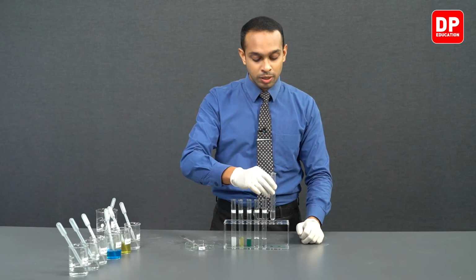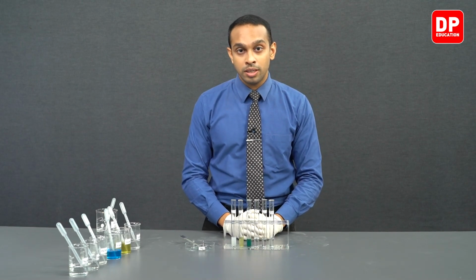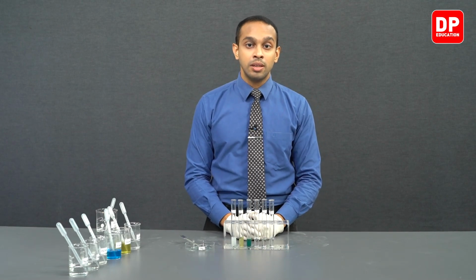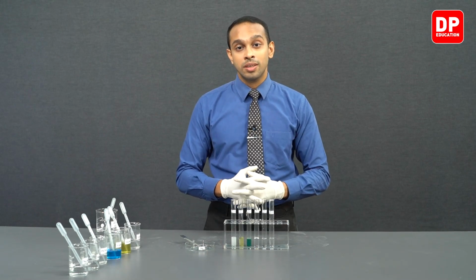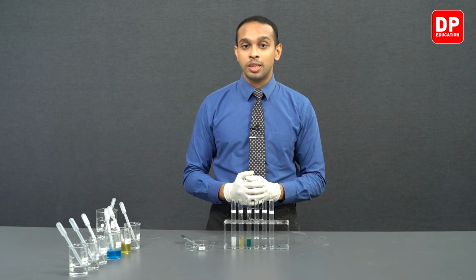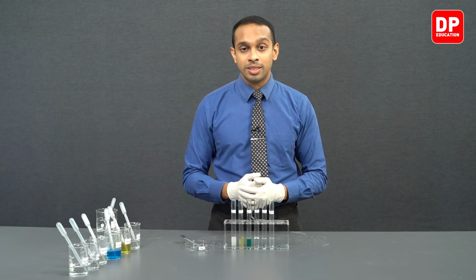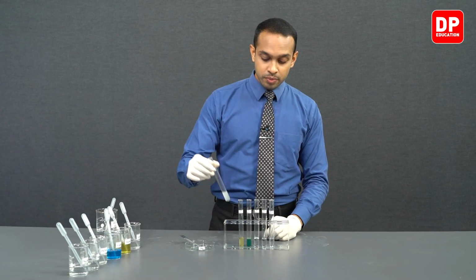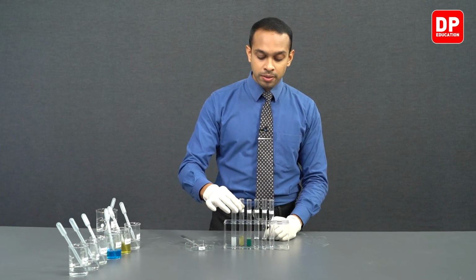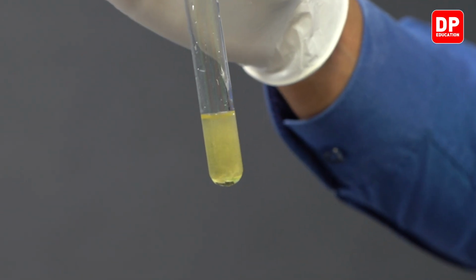As you know, magnesium is present in the second group of the periodic table. It's an alkaline earth metal, and this group shows very slow reaction with cold water as well, but with hot water or with steam, it will show faster reactions. So the bubbling that you observe is due to magnesium mainly reacting with water.